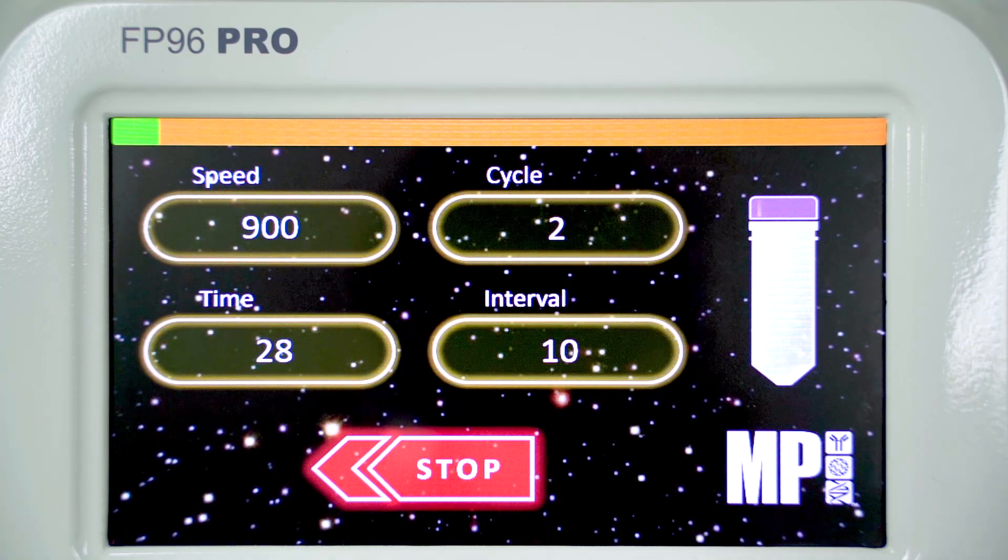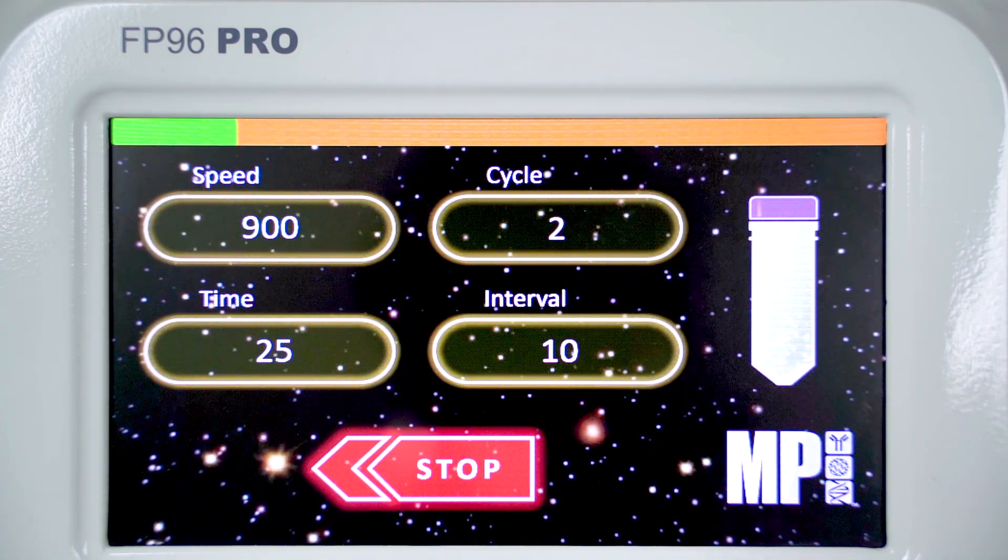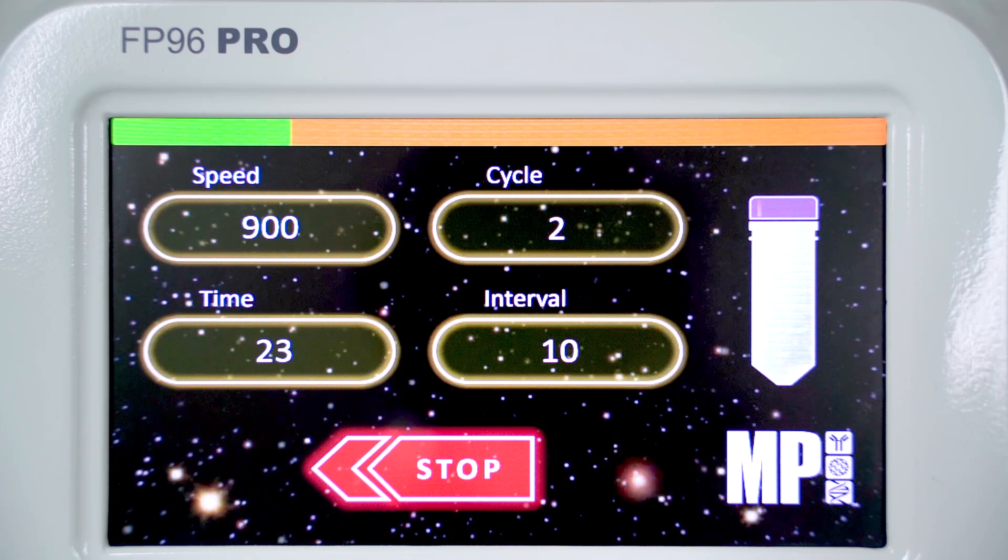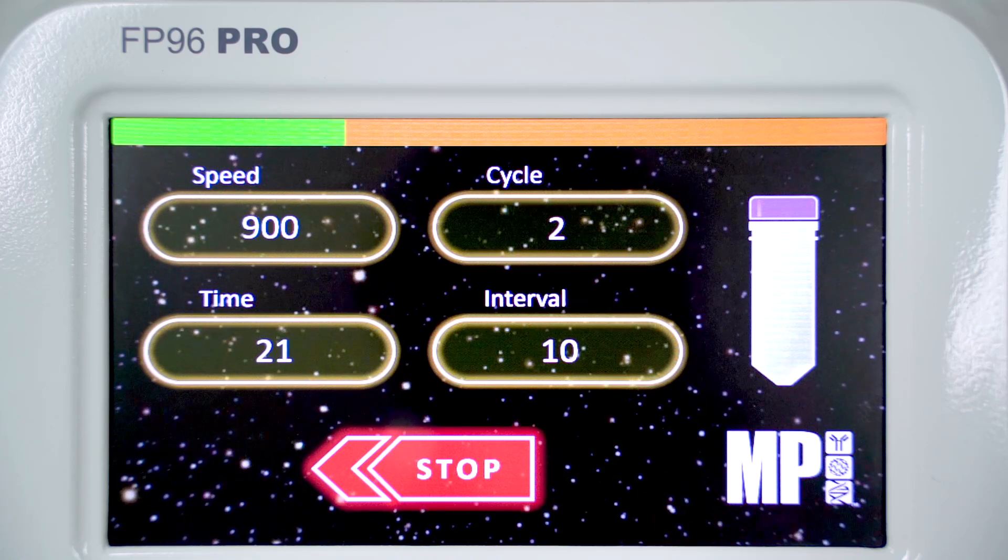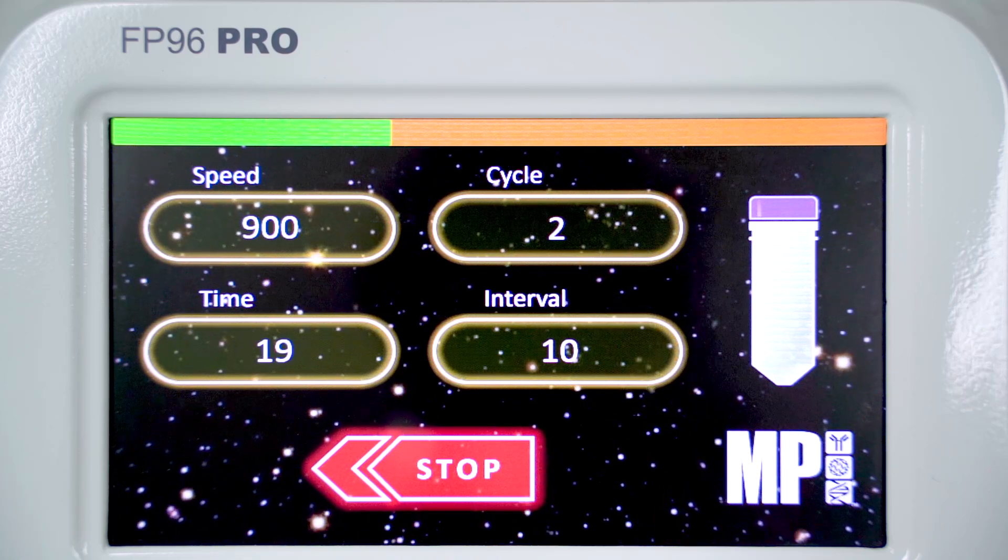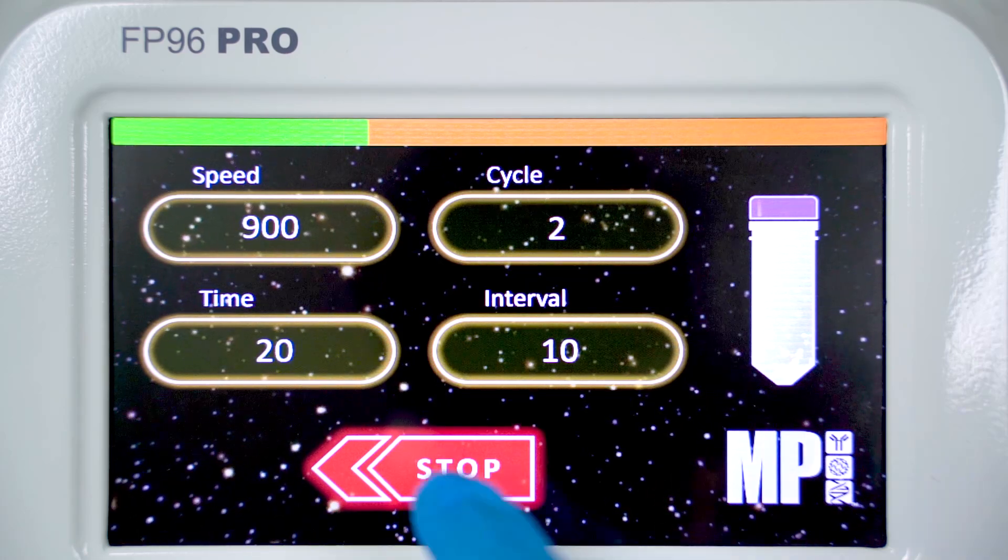The run screen will appear immediately, showing all parameters in real time so you can easily keep track of the run status. If you need to reset the parameters or stop the run, just press the stop button and everything will halt immediately.